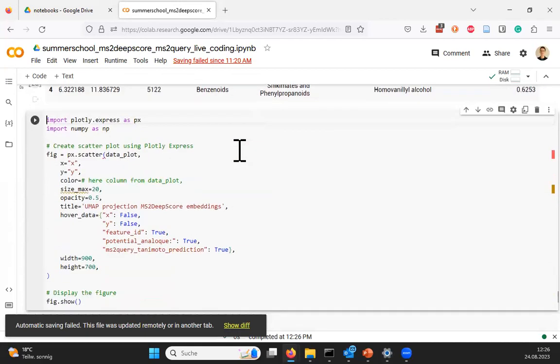And then we can do the plot that we did before again, but now we can color it by everything that we like. For example, and that's very good this time, is superclass. So we say the color is superclass, and then we say, this is the question that was before. We can also specify what we show if we hover over the data.